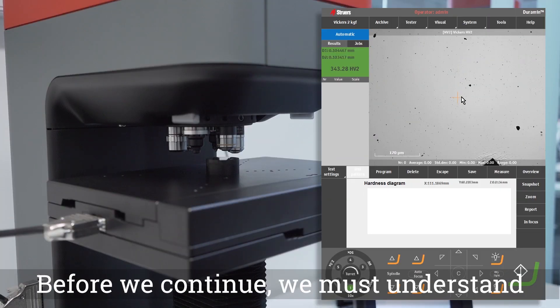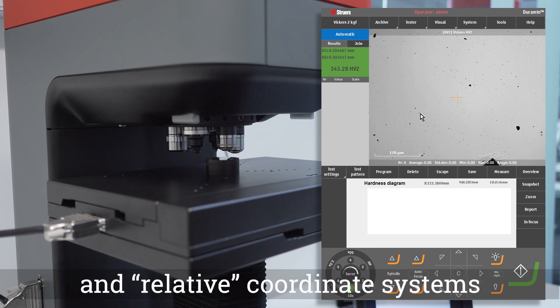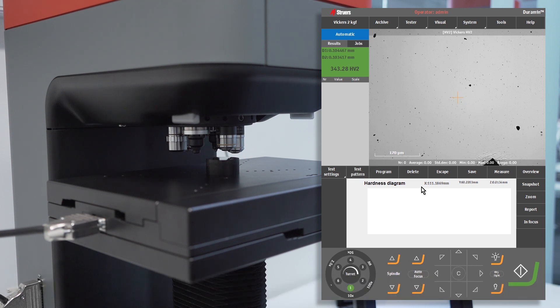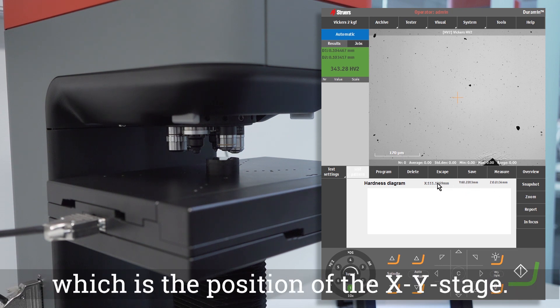Before we continue we must understand the difference between absolute and relative coordinate systems in the Duramin software. The coordinates shown in the main screen indicate the absolute coordinate system, which is the position of the XY stage.